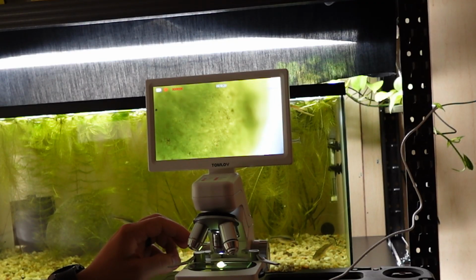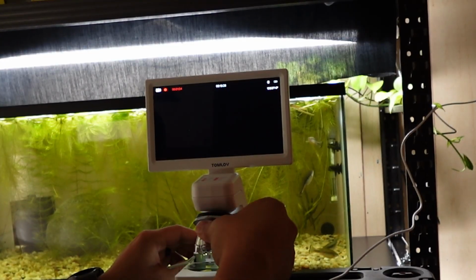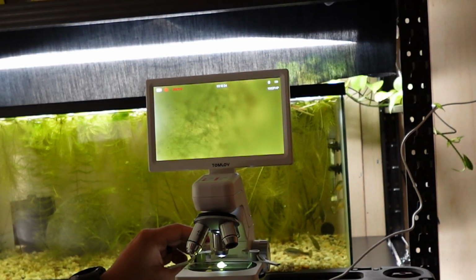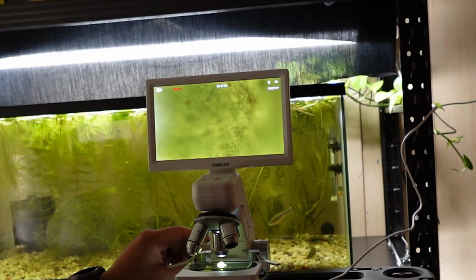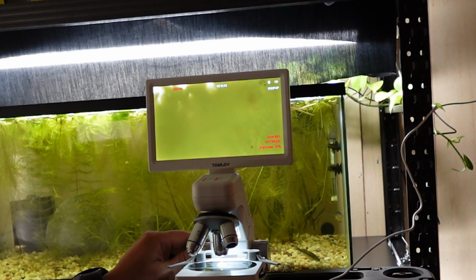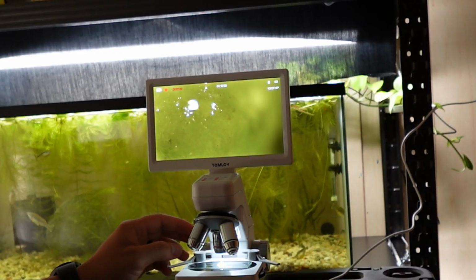I'm going to increase the brightness a little bit. And maybe I'll zoom in so I can change here. We can zoom in a little bit. See if this gives you a better idea of what it is. Ah, tons of little hairs almost. Switch it to the overhead light so we can get a better look at it. Very green, blob-like. Has some life in it from what it looks like.